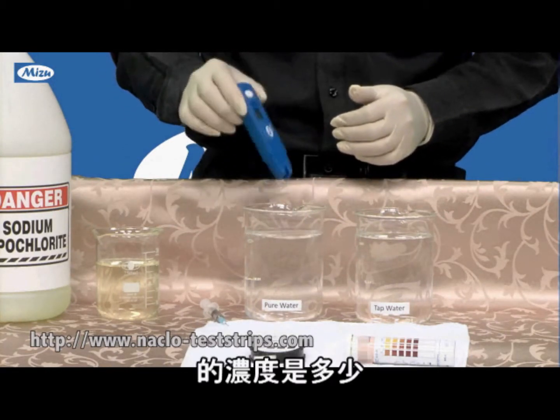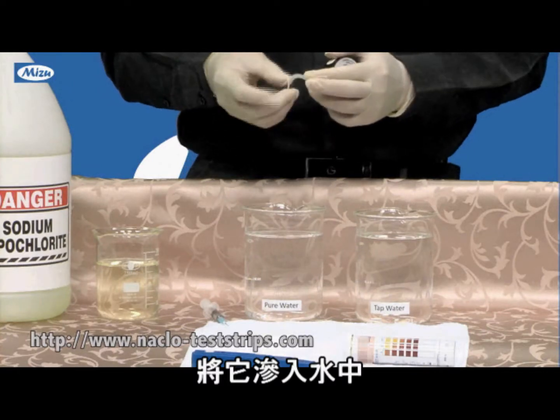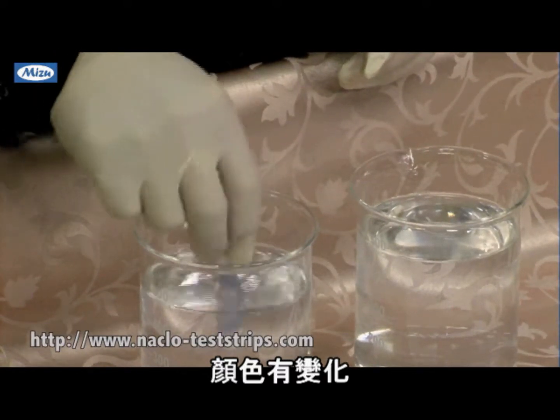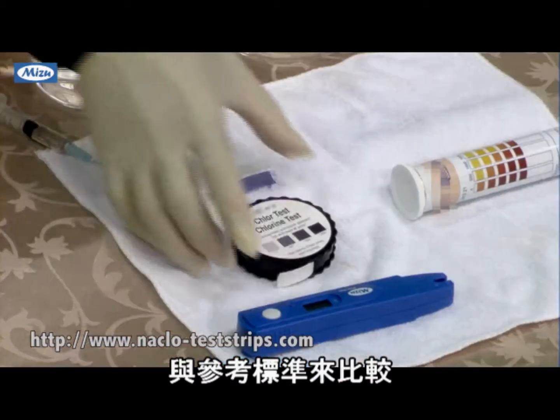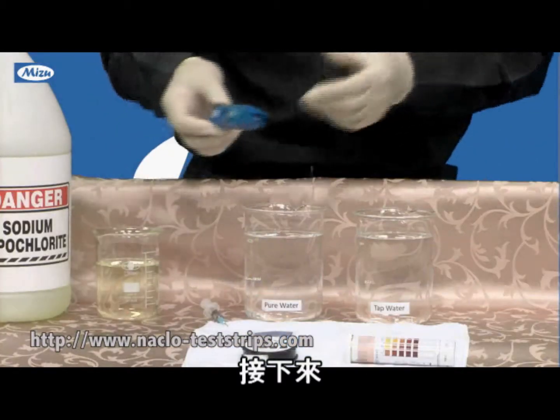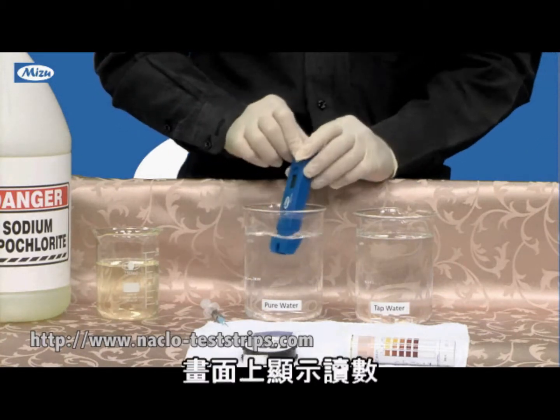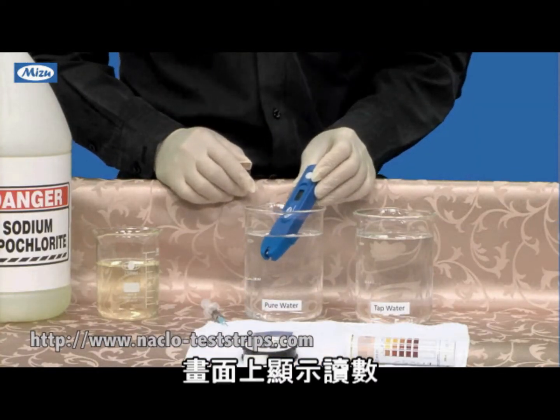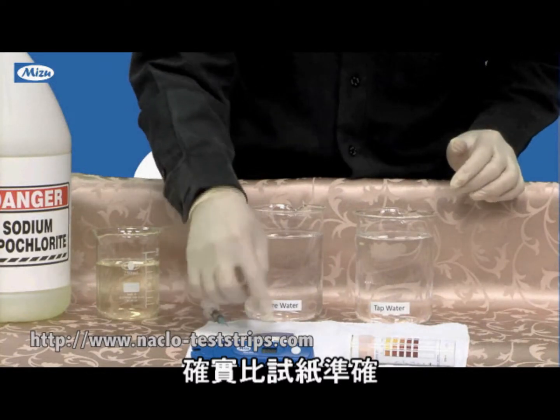So this solution I prepared — how much is it? I take this test strip and dip it in the water. This is the color I have. Comparing the colors, it should be around 50. I take this pen in the water, and the concentration reads 48, compared with the test strip. Yeah, it's less than 50.